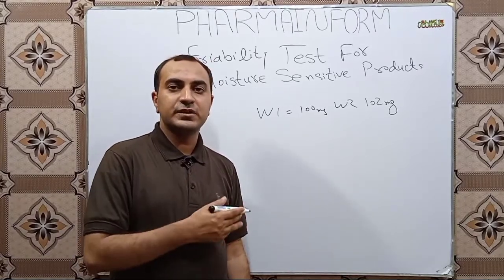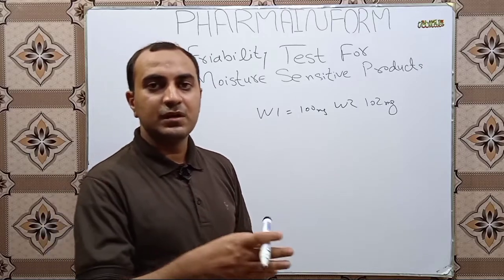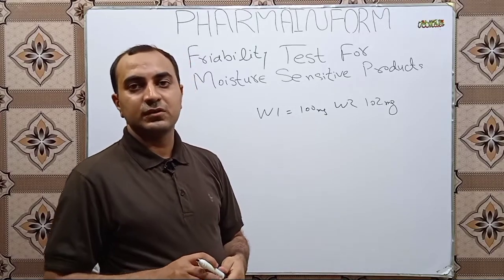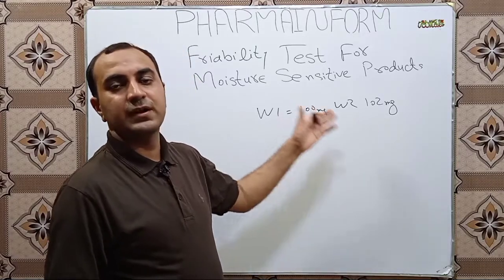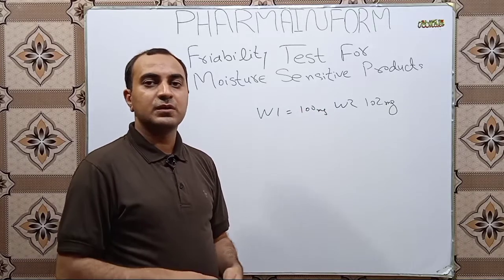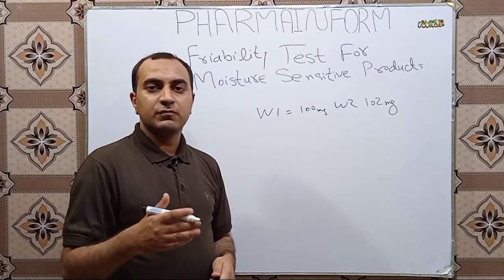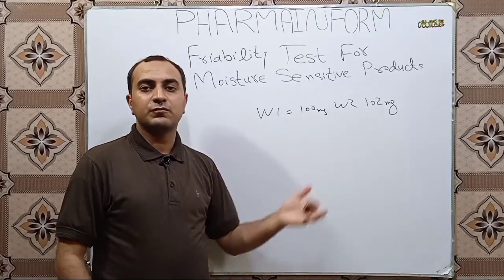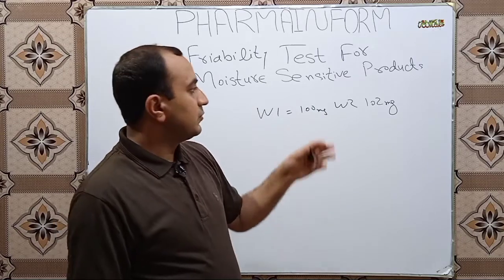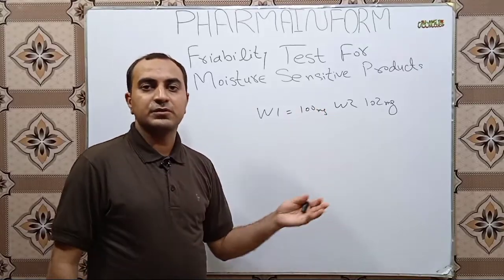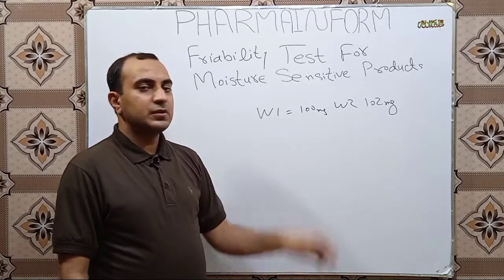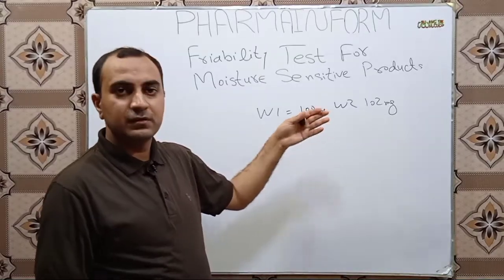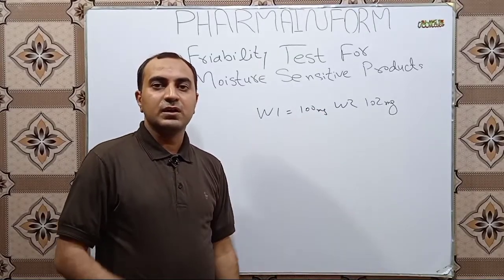The solution is to always perform the friability test for moisture sensitive products in a controlled environment — meaning perform the test where temperature and humidity are controlled according to the requirements of that specific product. For example, at 30 to 40 percent relative humidity and 24 to 25 degrees centigrade. When you perform the test at controlled temperature and humidity, this problem will not occur and values will be in positive range as calculated in normal scenarios.